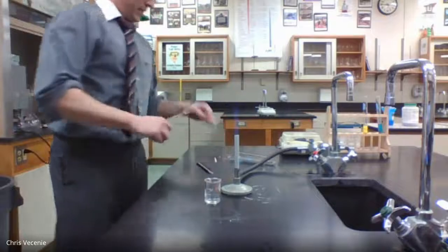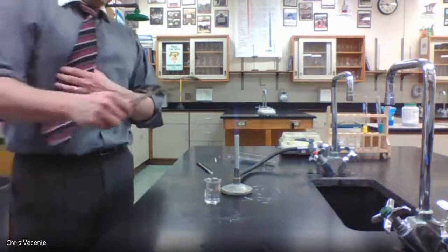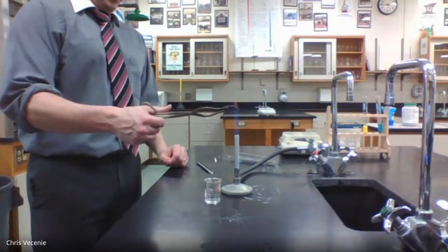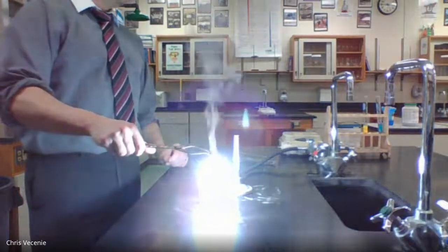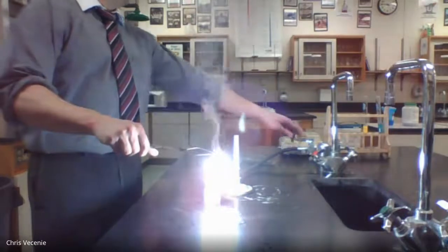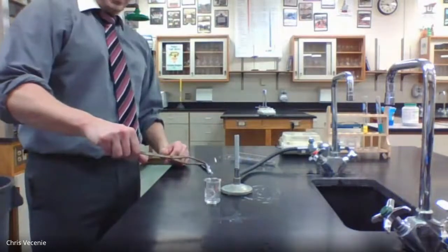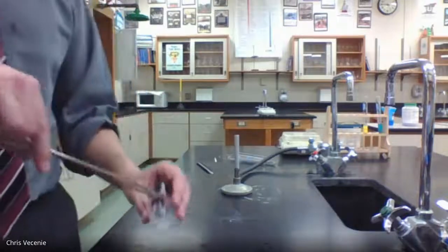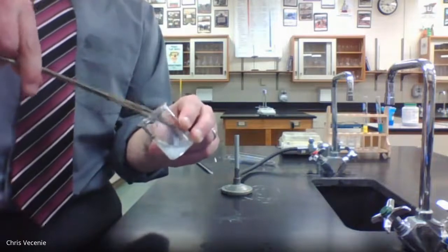Going to get my magnesium ribbon. And the observation for this will be very easy for you to see once it starts. I'm going to turn away because we should never look at something that bright. And then using my peripheral vision, once all that bright light goes away, I know I can look at this.